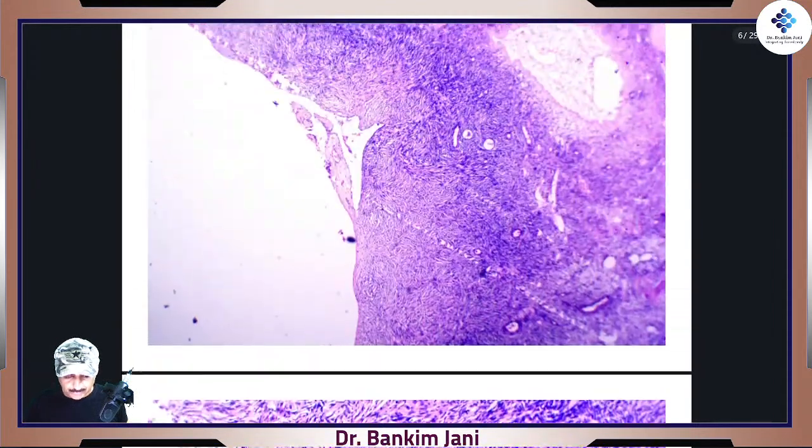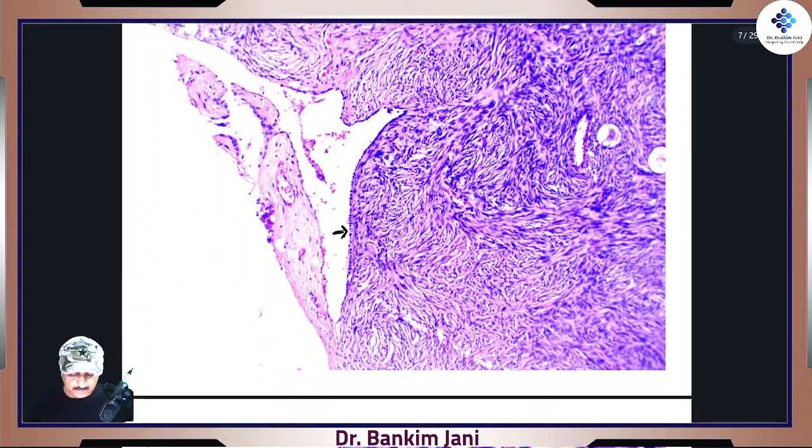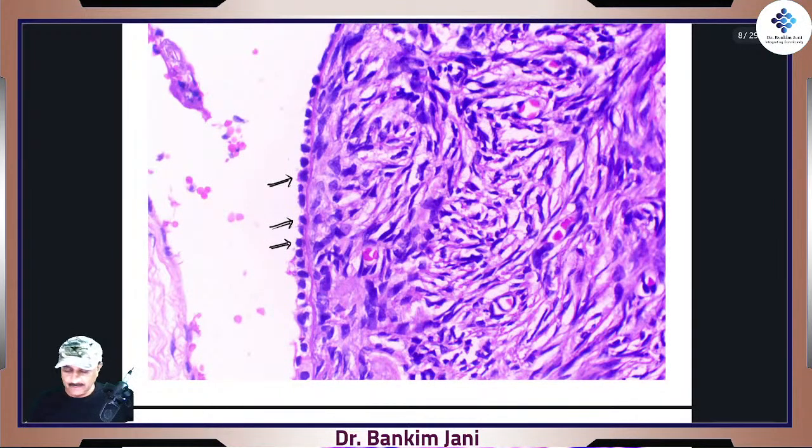And now when we go back over here, well, this is the area which we are focusing on. Now here it is not that much appreciable on the surface, but very carefully if you see, just dot, dot, dot, dot, dot, right? All those dots are seen. But as we zoom further, now it is crystal clear that they are classical cuboidal and single layer, right? No doubt about it. Very proper single layer.